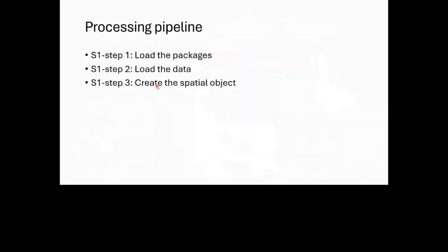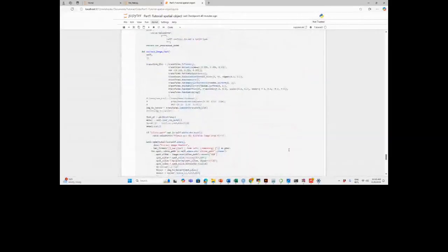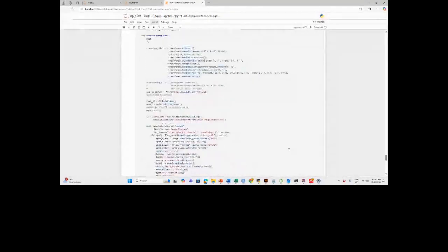The question that I was asking you is how many pixels you go from the center? It depends on the size of the cell, the largest cell. What was the criteria that you use to design? The criteria that we use to crop the image is to check the largest cell in our data set, and then we crop all of the images to be of the same size, and that size is the width and the height of the largest cell.